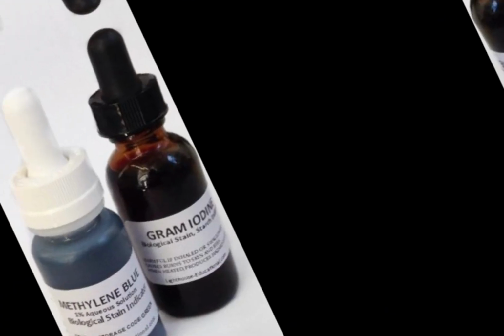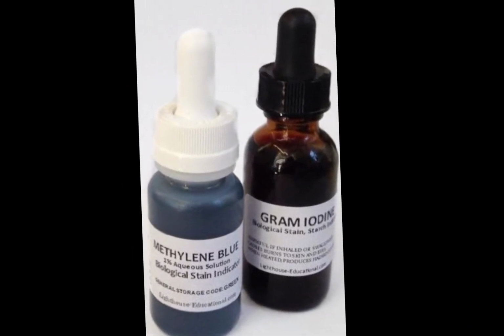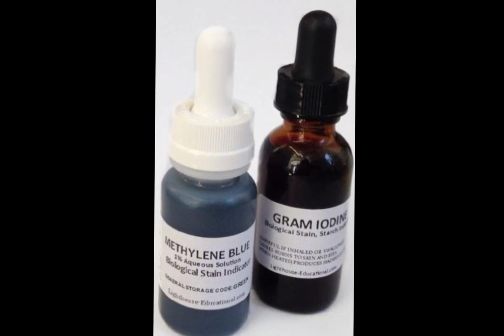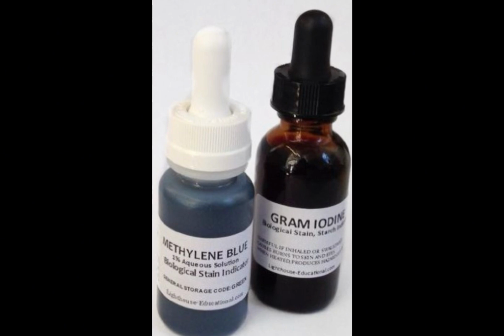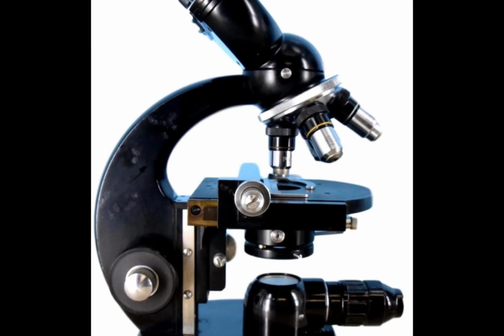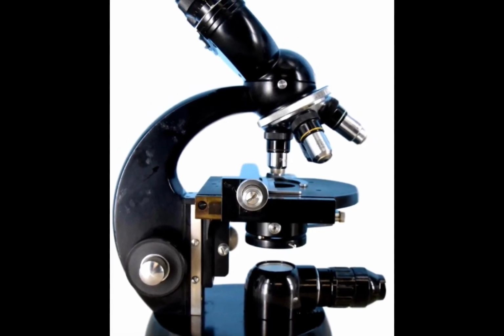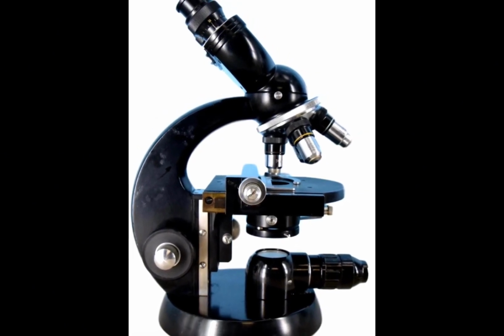We also need either iodine solution or methylene blue, which we are going to use as stain. They are going to stain the cells so that they become more visible under the microscope. We also need water, and then finally we need the microscope. It is used to observe the organelles found in the cell.